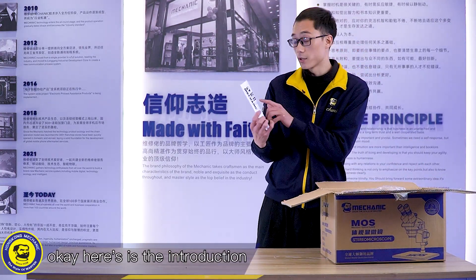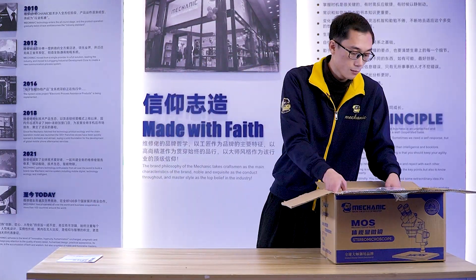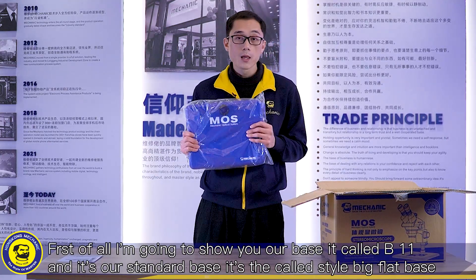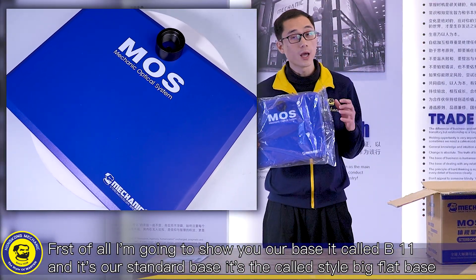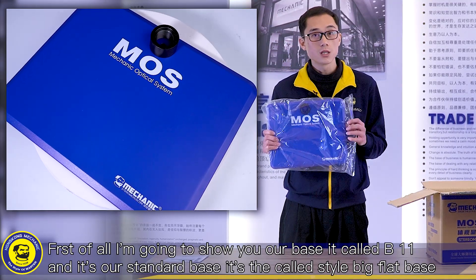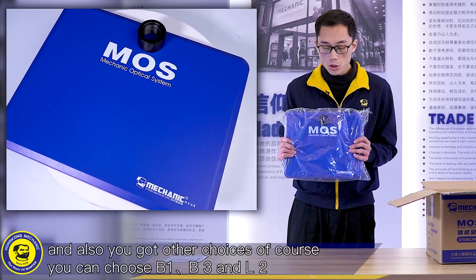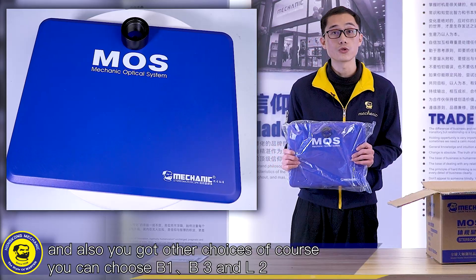Here is the introduction. First of all, I'm going to show you our base. It's called B11 and it's our standard base. It's the column style big flat base, and you also got other choices — of course, you can choose B1, B3, and L2.